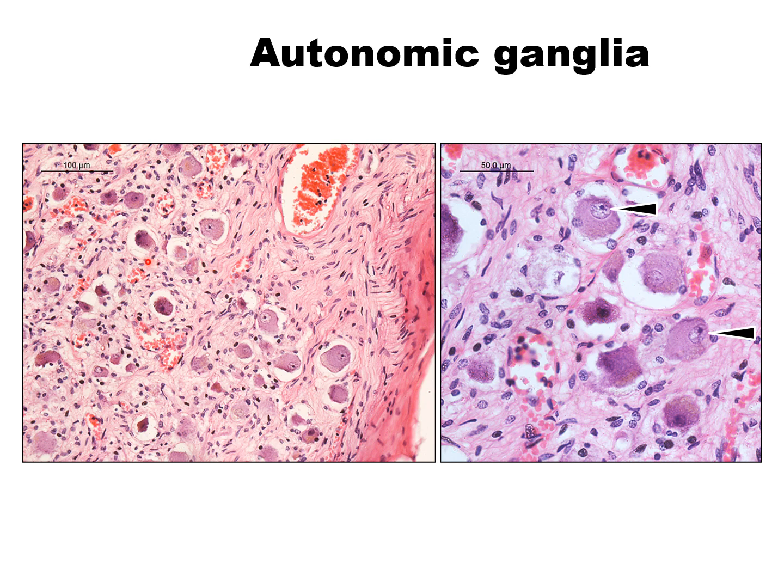Neurons in low power look round, but see the position of the nucleus. In higher magnification, see the position of the nucleus. It is eccentric in position, away from the center. And the dendrites come out from different surfaces of the neuron.